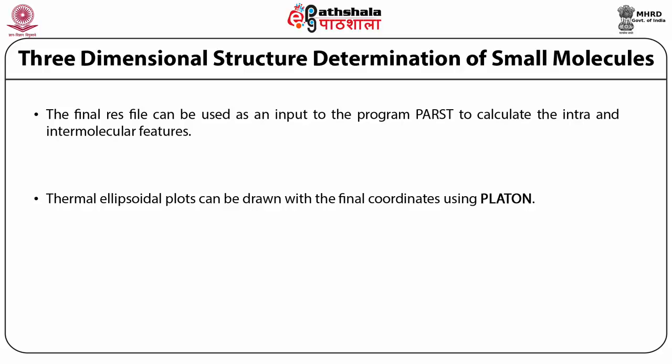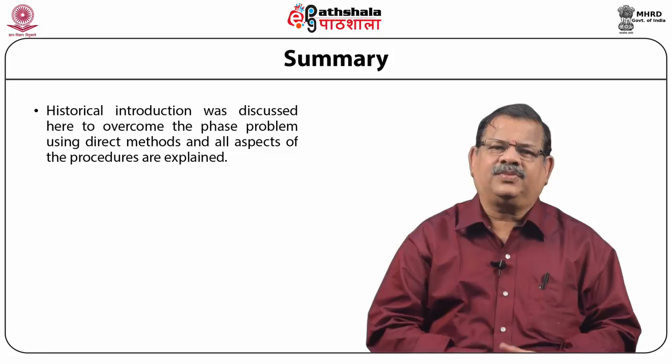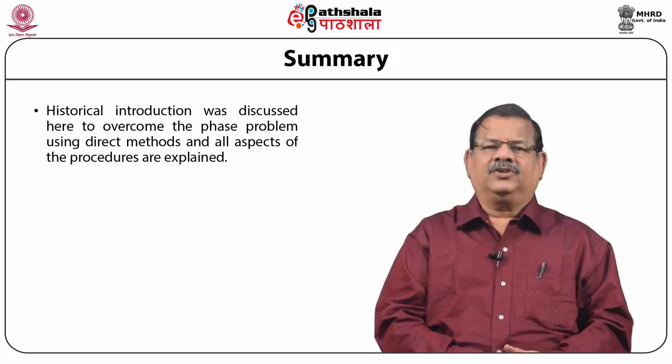So, students, let us summarize what we have learned in this module. A historical introduction was discussed here. How to overcome the phase problem using direct methods, and all aspects of the procedures are explained, because this is a Nobel Prize winning topic, and Professor Hauptman and Karle have contributed substantially in this field, for which they have been honored with the Nobel Prize.